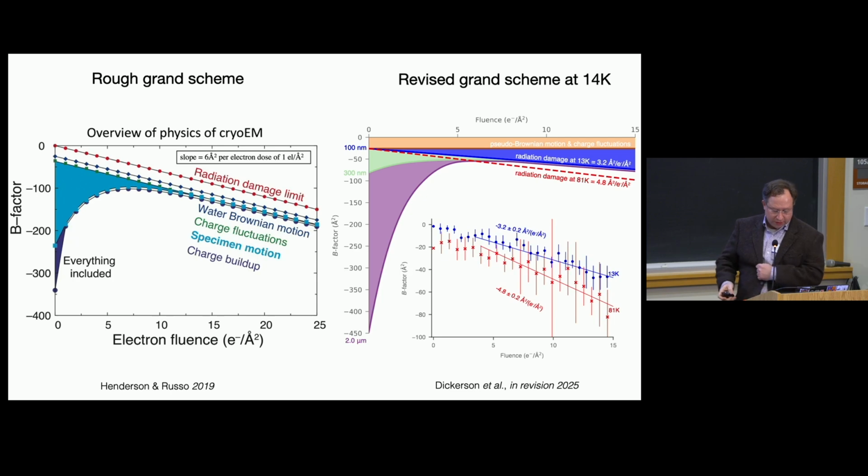And the conclusion is that over several different structures at liquid helium temperatures, we get better data in every single frame of every single image, which means that this is just not something we can leave behind in our field, because this will allow us to solve smaller proteins, more difficult structures, and all of the rest of it.